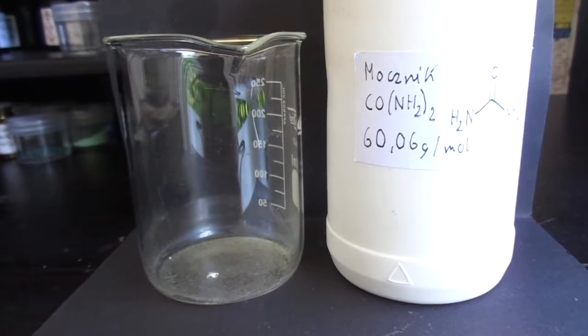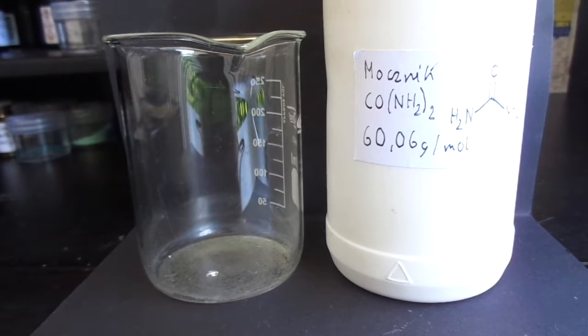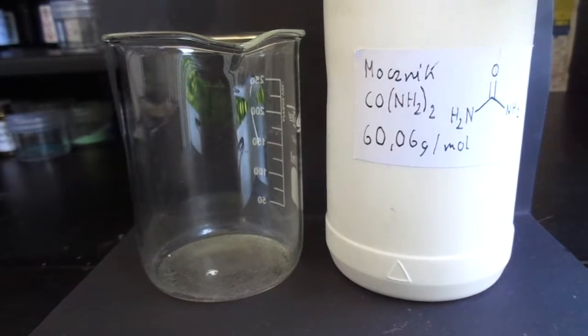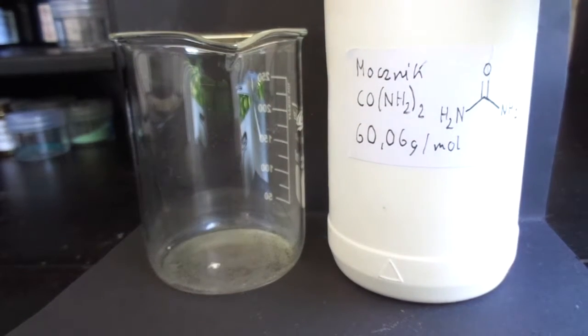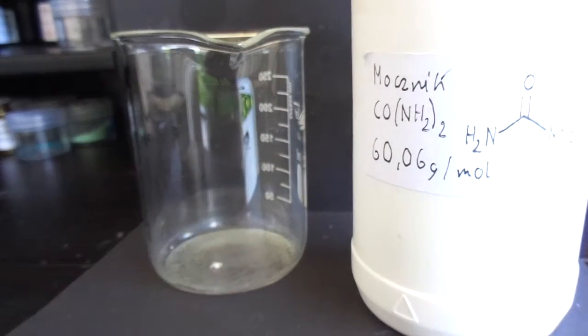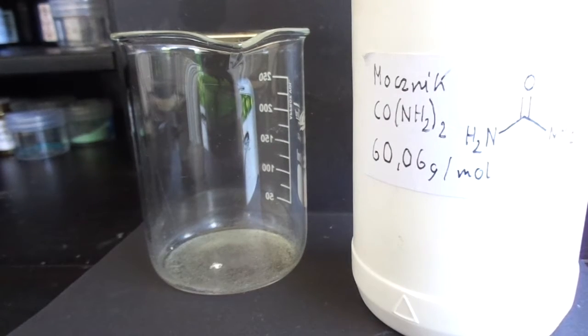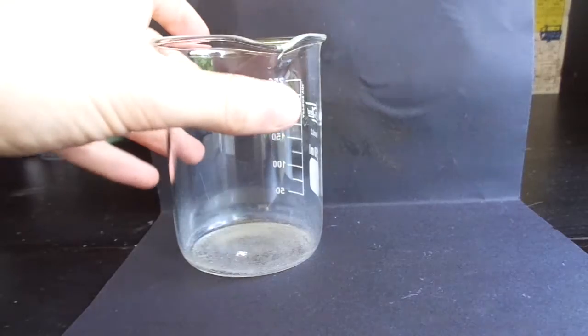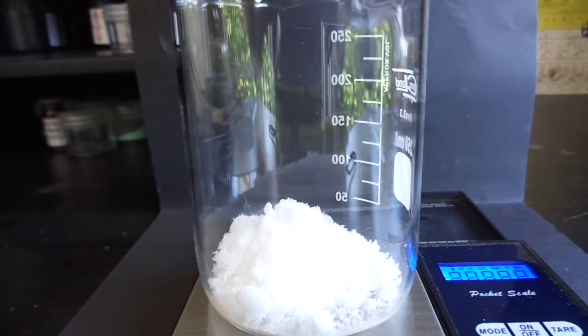Hello, in this video I'm going to do some urea chemistry. You might think that urea isn't used for many reactions — it is used for making hydrazine sulfate, but besides this it doesn't have much use. I've got a whole heap of urea here and we're going to try to make some biuret and also cyanuric acid. I'll measure out maybe about 20 grams or so.